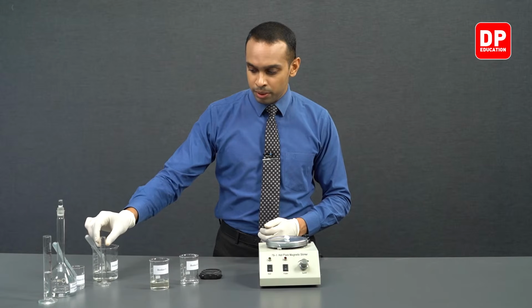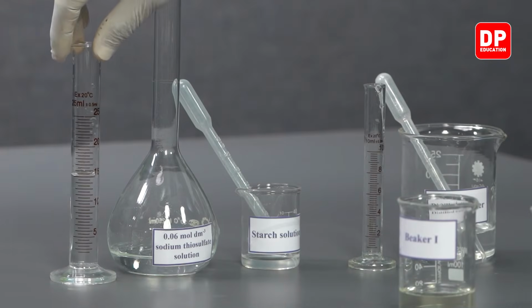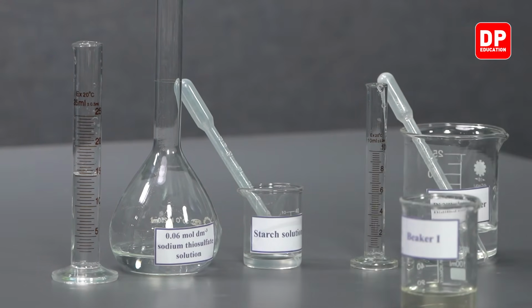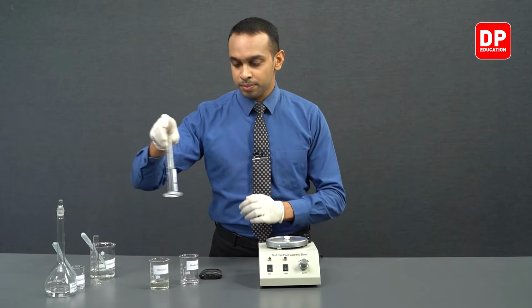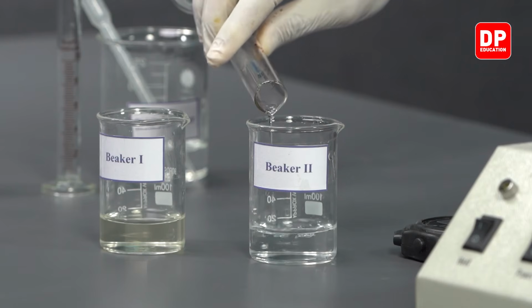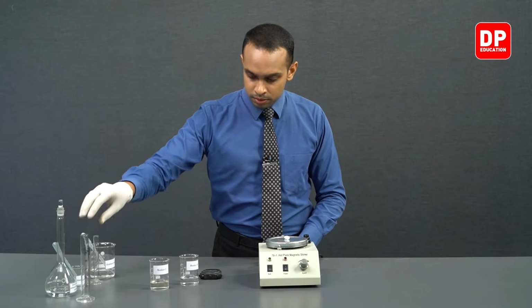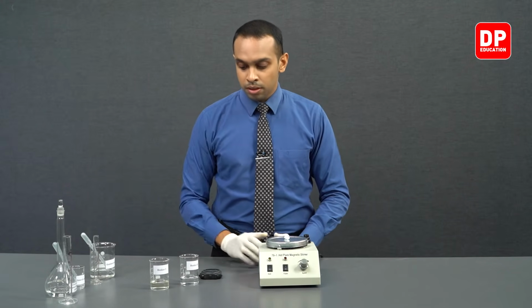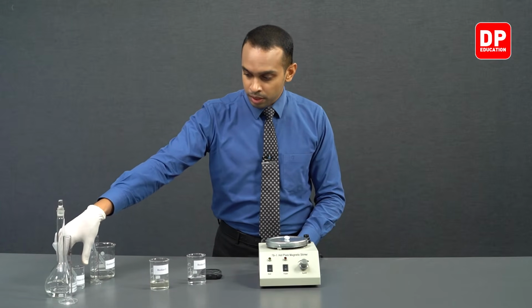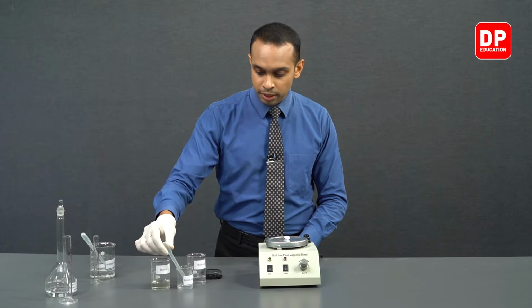And like we did in the previous experiments, we are going to add 15 cubic centimeters of sodium thiosulfate solution also into this beaker. Apart from that, students, we are going to add our starch solution into the beaker 2 as well.